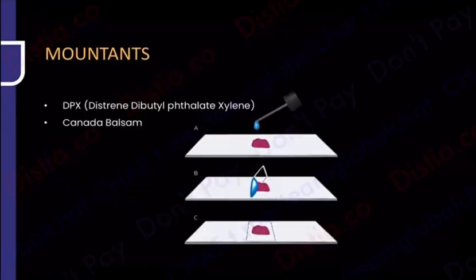And finally, your slide is ready. Can you see? The pink and blue slide is finally ready. And now you have to look at it under the microscope. But before you look at it under the microscope, cover the tissue, otherwise the tissue will become dry. Today, for example, your slide got stained, but you are going to look at it tomorrow morning. Your tissue will dry till then. So what are you adding? You are going to cover it with a cover slip. How do you stick things? You need some glue. How do I put a cover slip on top?